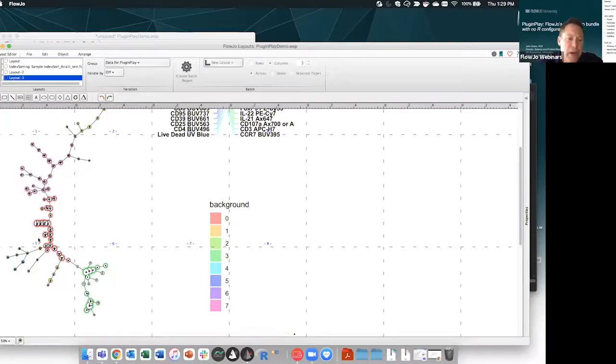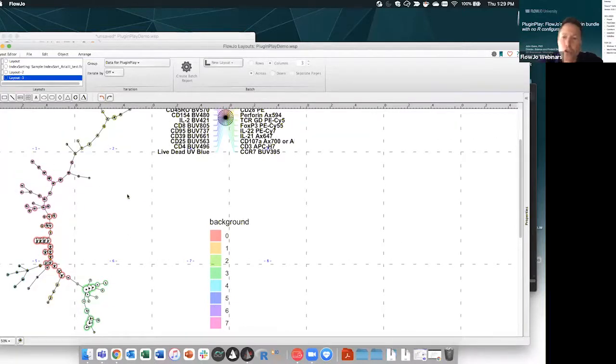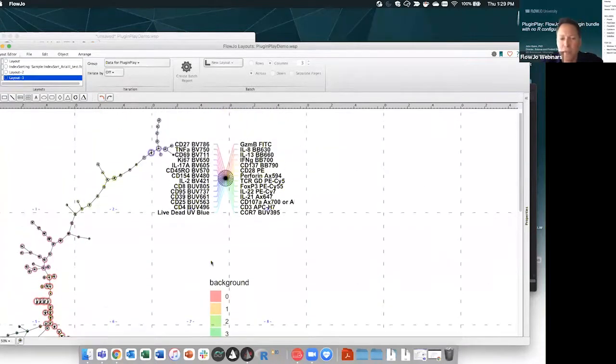And you can see we've divided up the data basically into groups of tightly packed nodes, which indicate common phenotype. And the distance of the line between them is how similar or dissimilar any two nodes are, and then it divides up where you have a branch. So there's the light blue one, the green one off of this pink backbone, the green one, and so forth, again with the color indicated here.